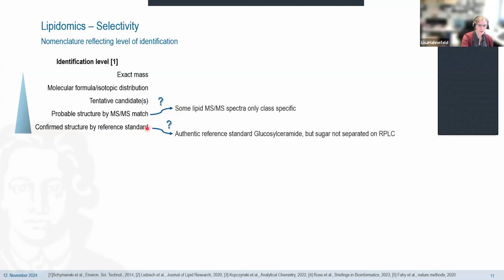And maybe you even have a reference standard to confirm the retention time as well as the spectra, but are there isomers? Because if there are isomers, you basically should buy all of these isomers, have reference standards for all of them, and then actually prove that all of them are separated using baseline chromatographic resolution. Otherwise, you cannot confirm that it's exactly this compound. And for data evaluation, especially if you're going to pathway analysis, this can be really difficult, because a biologist usually wants to have a specific compound, but for lipidomics, mostly that's not possible.